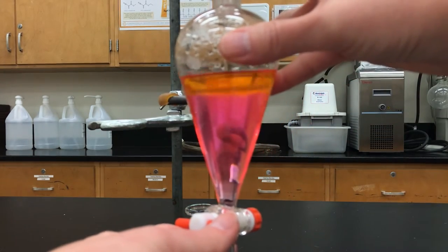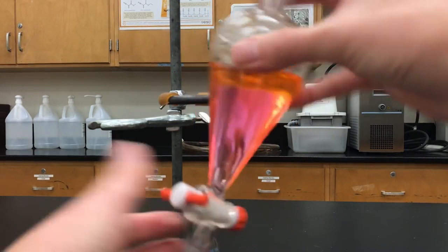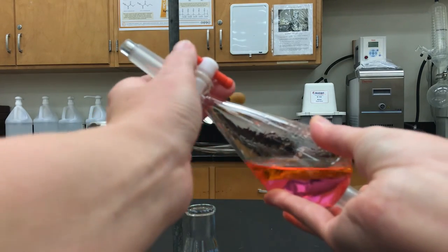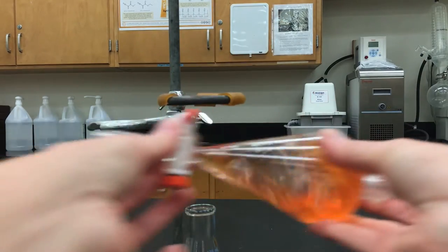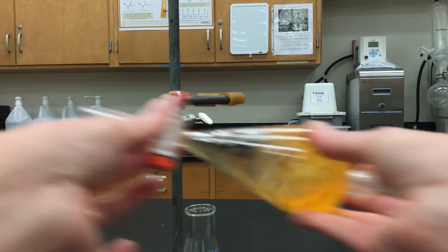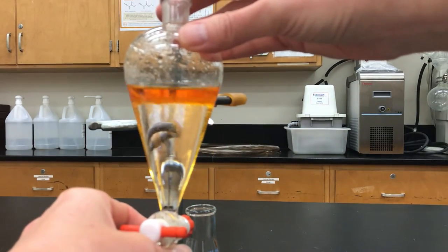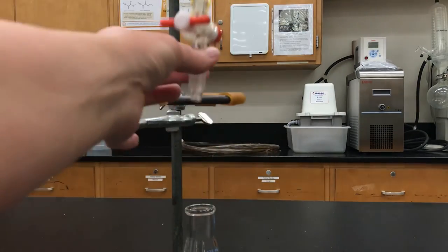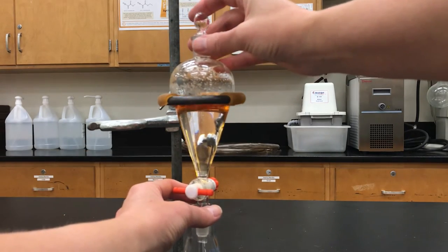I invert it a few times and give it a good shake — notice that the top layer is getting darker and the bottom layer is getting less pink. After another venting step and a good shaking of maybe 10–20 seconds, we can see that the bottom layer doesn't look pink at all. Most of the methyl red molecules have been extracted into the top layer, making it look orange.